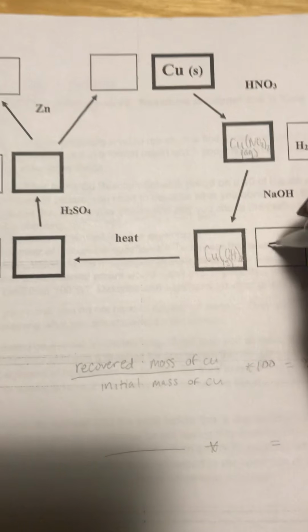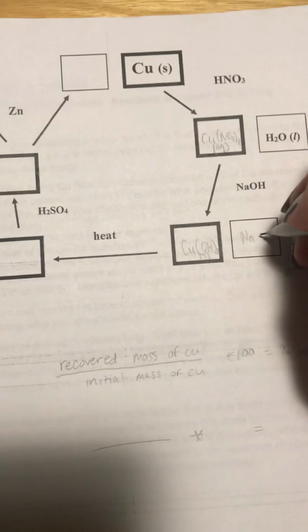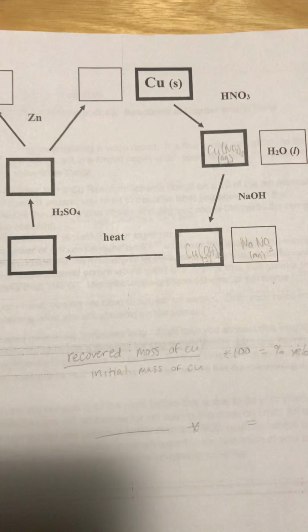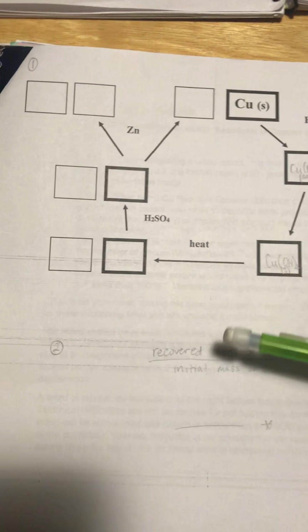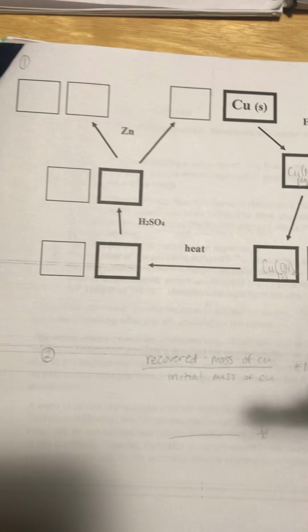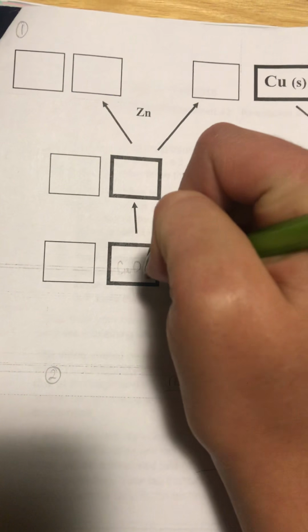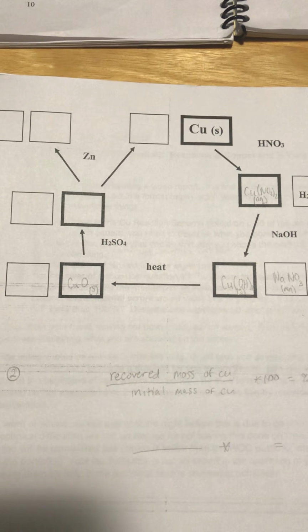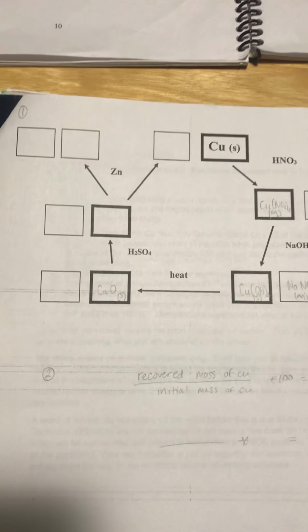And also we can see here the sodium nitrate, a colorless solution, which is created as an aqueous solution. And then after this, we heat our solution, as you can see there, and we then see copper oxide, CuO, as a solid. It starts as black specks that form at the bottom. They eventually mix throughout the solution and become a very clumpy, thick black precipitate.